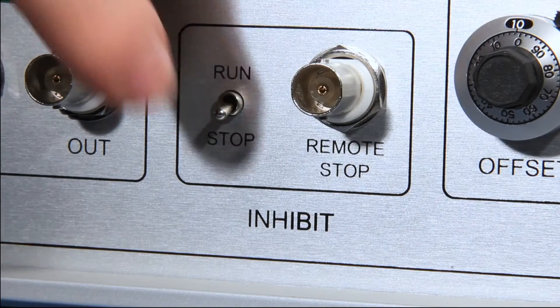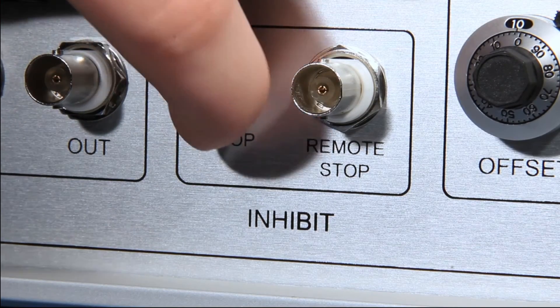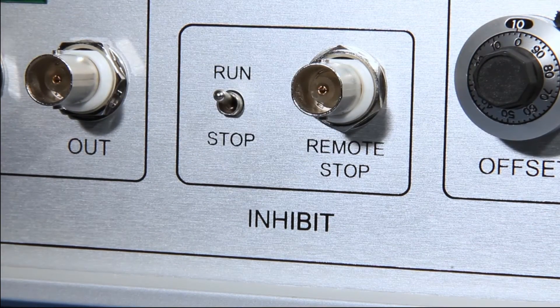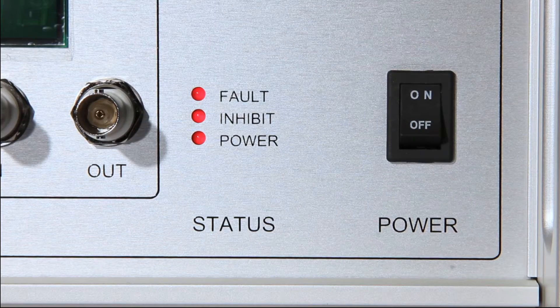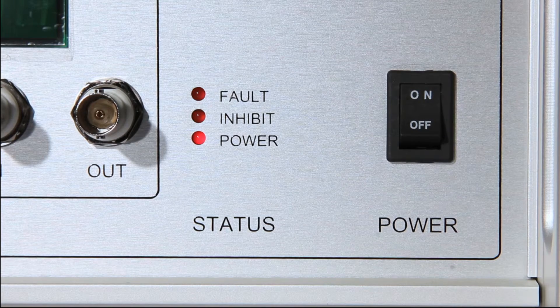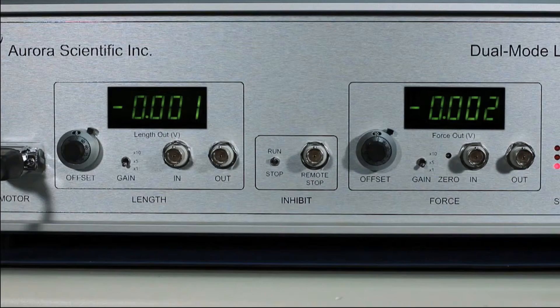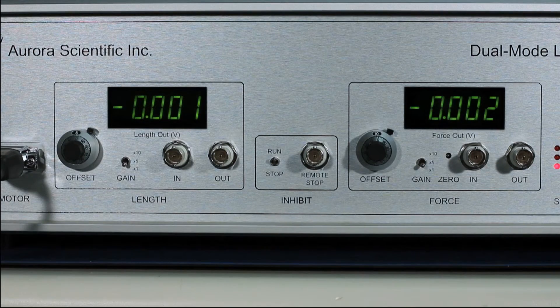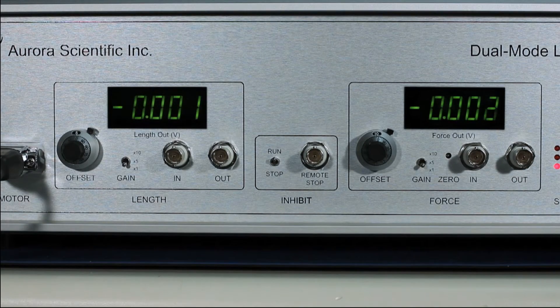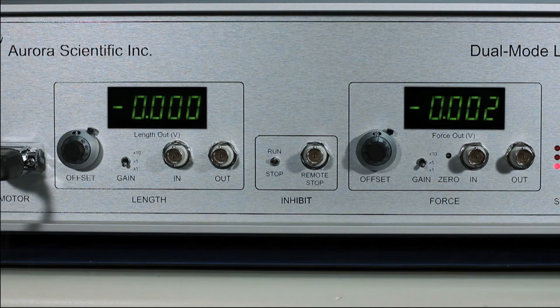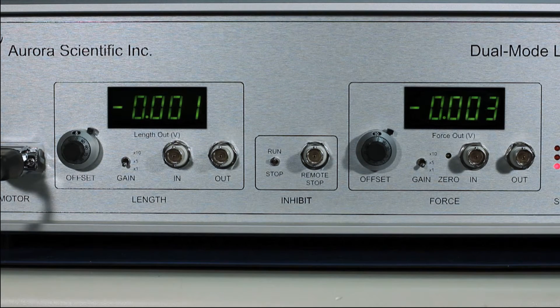Flip the inhibit switch to the run position. Both the inhibit and fault lights should turn off. Both the length and force out displays should also read near zero.